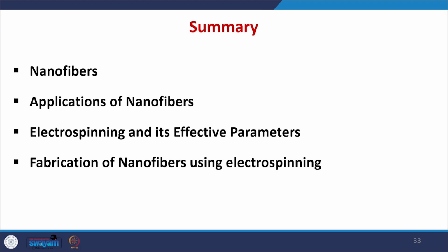As a summary, in today's lecture, we learnt about the nanofibers and what are the various applications of nanofibers. We also learnt how to fabricate nanofibers using electrospinning and also the various parameters involved in the electrospinning process. By practical demonstration, we also learned how to fabricate nanofibers using electrospinning.